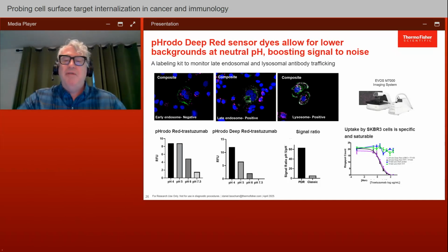The quantitation at the bottom comes by way of either a cuvette or high content measurement. Bottom left, you can see the red dye, the legacy traditional dye. At neutral pH, as I promised, it has a non-zero signal. It's not an invisible dye, but a dim signal that gets brighter, with a half maximal that is quite fully activated in the pH of a late endosome. It will be quite bright, showing a 2- to 3-fold delta in signal from the early endosome, with the appearance of Rab5.